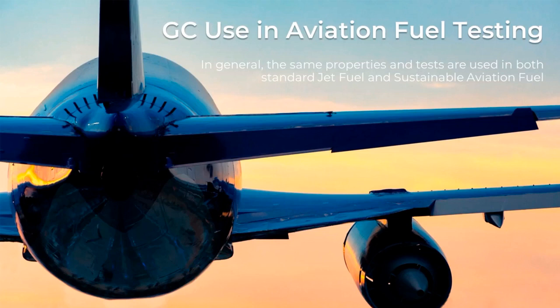The aviation industry is determined to develop sustainable solutions to produce cost-competitive, high-yield jet fuel with minimal environmental impact. It is common for some governments to mandate the use of renewable components. The introduction of biodiesel into many countries has created a new threat to jet fuel quality. Thus, we will require a solution for this analysis to ensure the quality of the fuel is unaffected by the mixing proportions of renewable components.